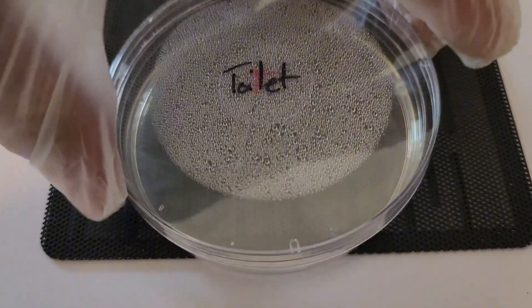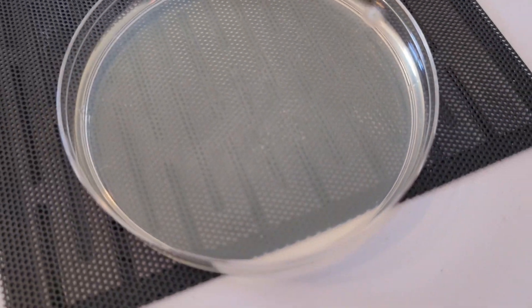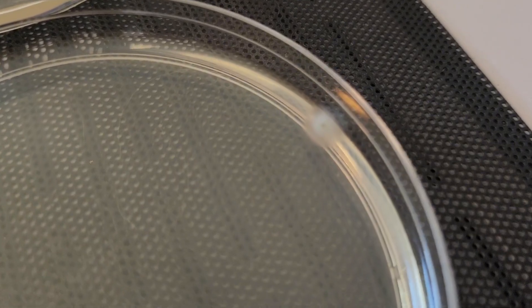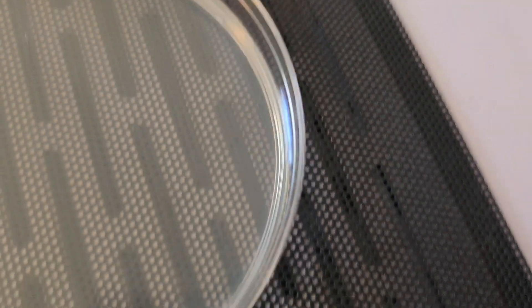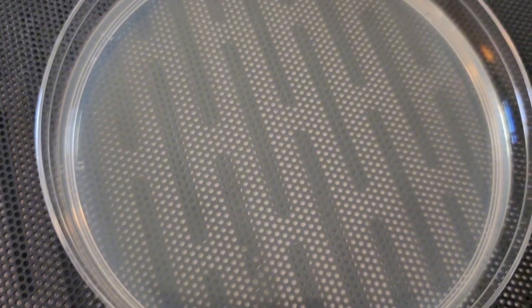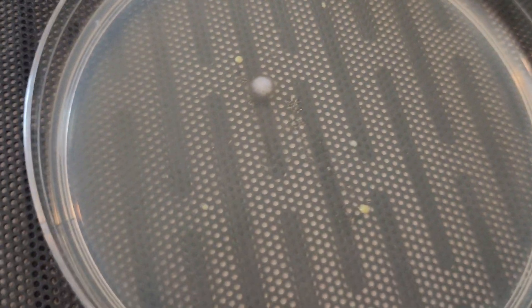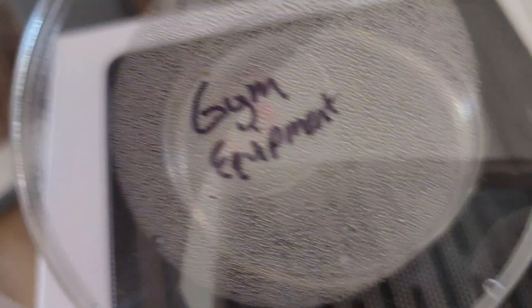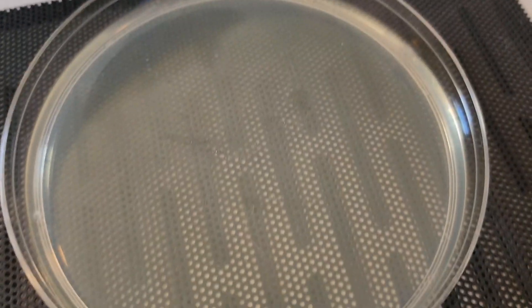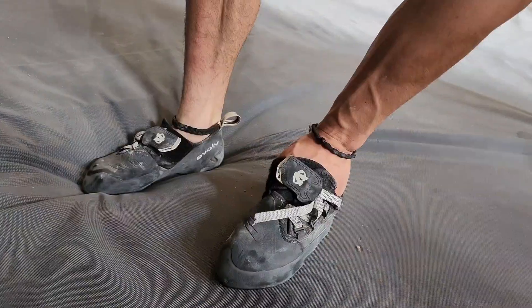Here are the results of the petri dishes. This is day one — this is the toilet seat and you can notice a tiny bit of mold or something. The packet of petri dishes gave me a website to refer to for different types of bacteria, growth, and germs. This is the control and there's nothing growing in here at all. This is the climbing wall and there are a couple of different types of bacteria I can identify just by looking at the different colors. For the gym equipment there's not much going on other than a tiny white puff at the bottom — actually less puffy, kind of goopy.